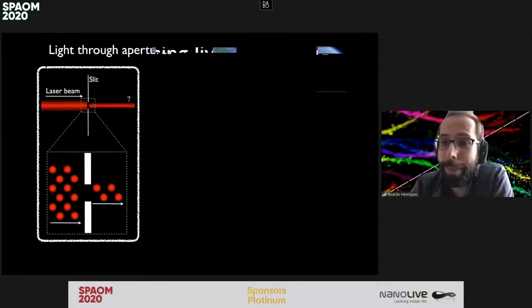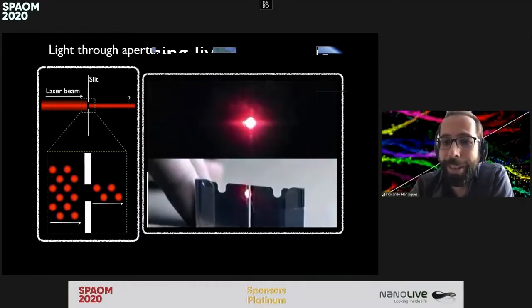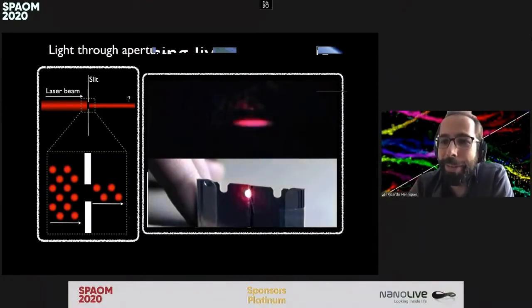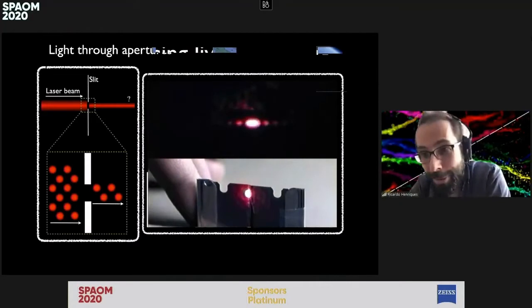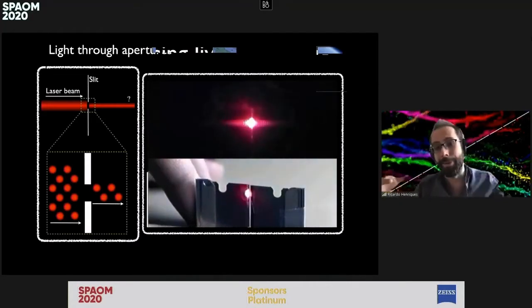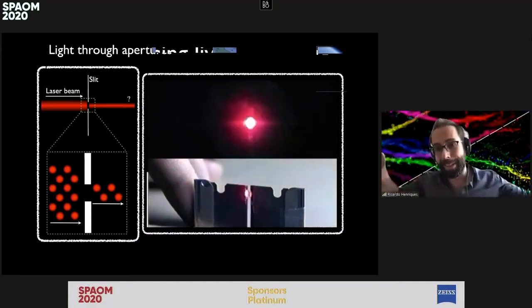So we did the experiment, and here's a movie of it. And what you're going to see actually blew my mind. It was crazy, right? Because what you're seeing here is exactly the opposite to what I was expecting. As you close down that slit, that light actually broadens and starts getting these side lobes.